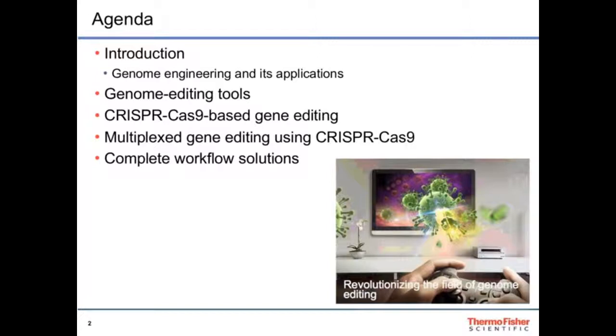And we'll finish on talking about the newest tools to the market, which are CRISPR-Cas9-based gene editing tools. And we'll talk about how these tools can be used for multiplex gene editing. And we'll finish today talking about complete workflow solutions that we provide from Thermo Fisher.